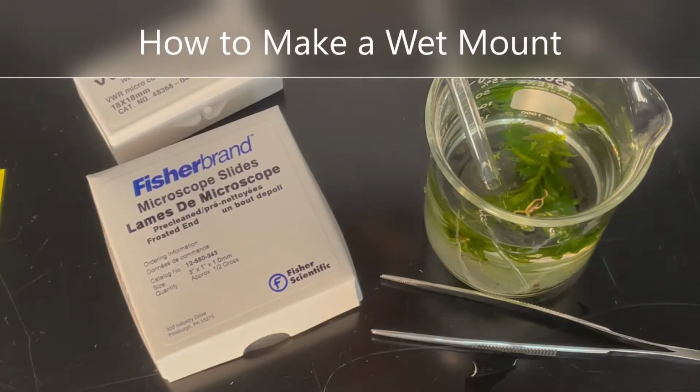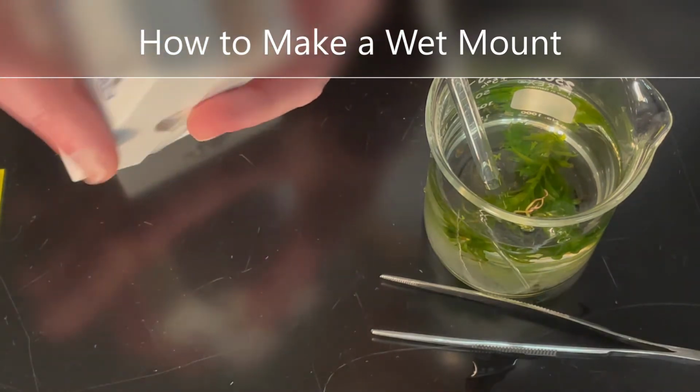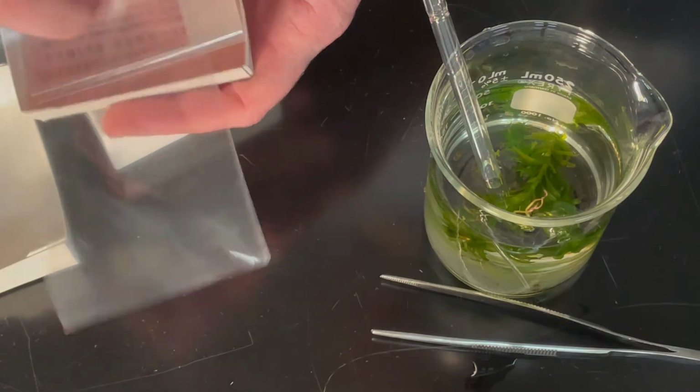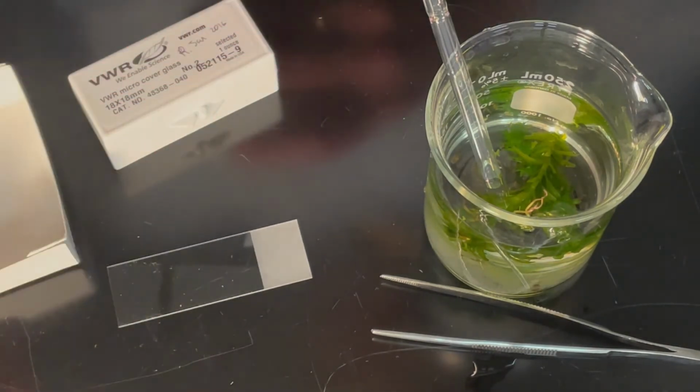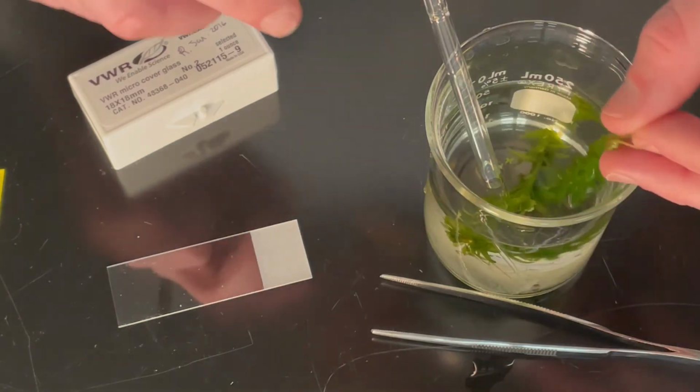What I'm going to do right now is make a wet mount. So I have all the supplies that I need. First thing I'm going to need is a microscope slide. So I will get one of those. There we go. Next thing that I need is my specimen.